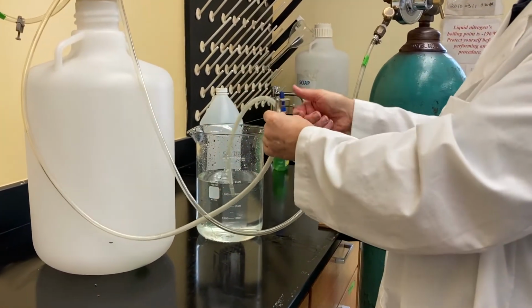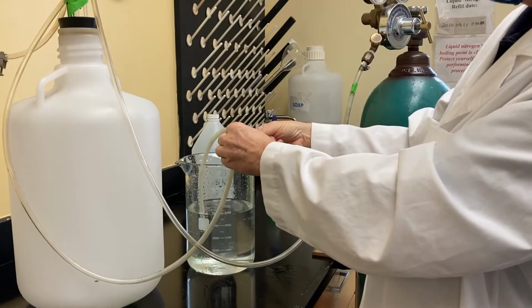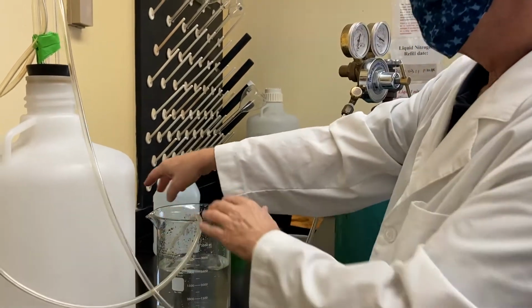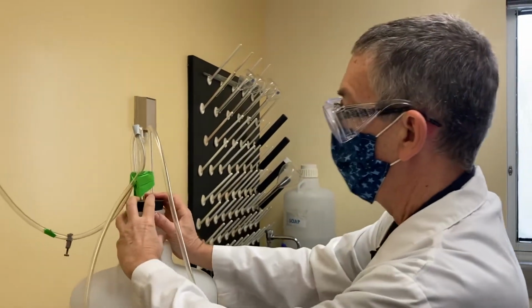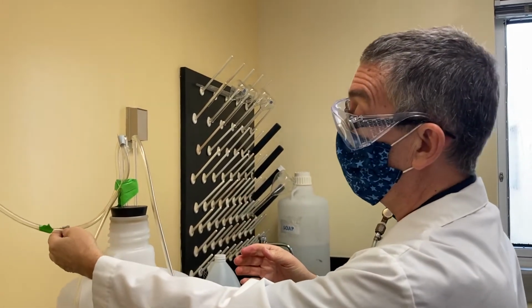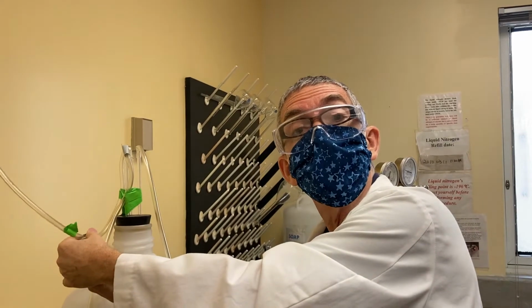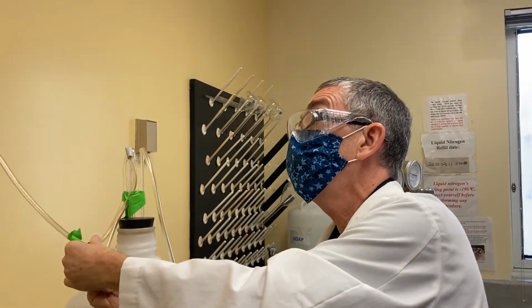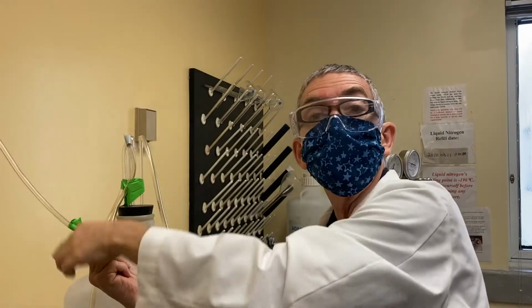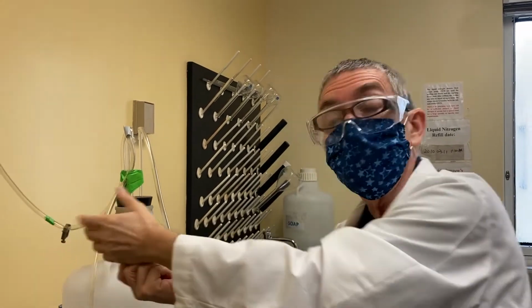Now at this point, I'm going to want gas to enter the carboy and purge it. So I'm going to have this clamp open. Simply put that in there and make sure that is tight. It doesn't really matter whether this is open or closed at this point. We're not measuring the pressure. Since you're just working with gases for about the first time, you might want to close it. That will protect you from possibly adding a lot of gas at once with high pressure and shooting the dibutyl phthalate out. So while this doesn't matter, in principle, it might be safer for you to do that.